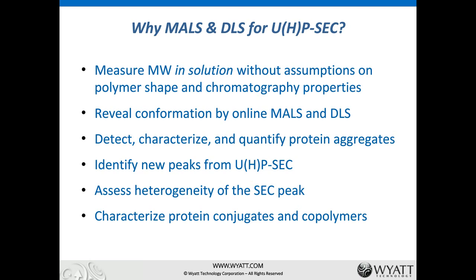Light scattering detectors are also very sensitive to large species, so they are great tools for detecting, characterizing, and quantifying protein aggregates. They also help identify new peaks from UHP-SEC due to its high resolution.